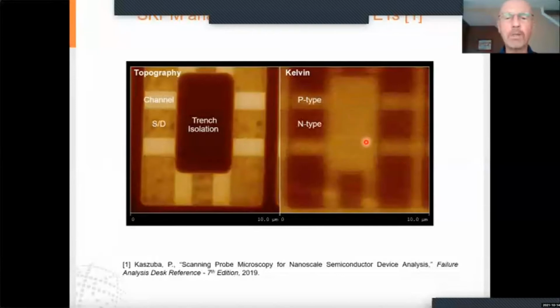Well, this came out of an analysis that we had done a few years ago. And when I was looking at the data in terms of the dopant profile information, I found a little anomaly down here. We can see this dark region in the channels, indicating that we've got a slightly higher N concentration in those channels.